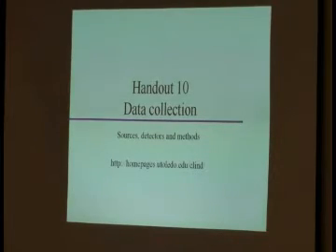So from now on we'll not just deal with the physics and the background of the things we are dealing with when we do crystallography, but we'll actually deal with what happens when we do a crystallographic experiment. And the first handout for that one is data collection. That is what you do if you want to do crystallography, right? You need to collect data.